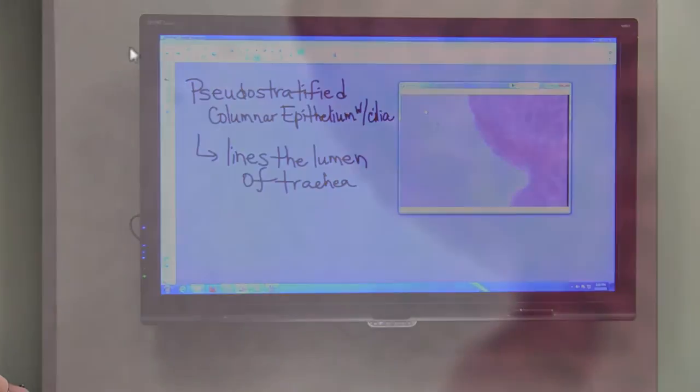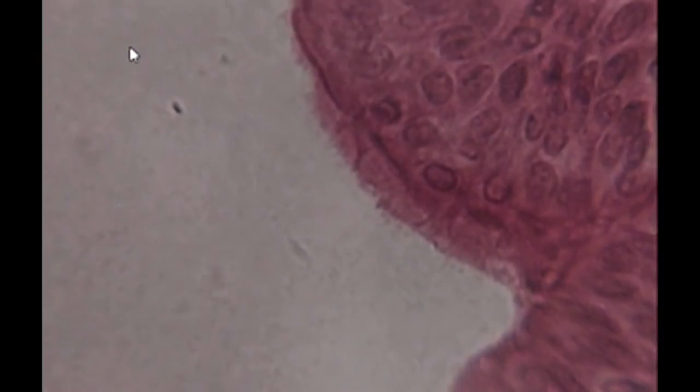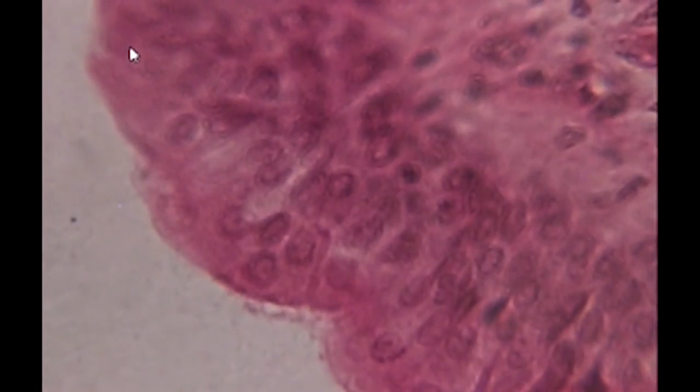Now, the thing about microscope slides is when these are made, you're cutting through different planes. We just want to find an area where we're looking at the tissue in a way that will help us understand exactly how it's put together.